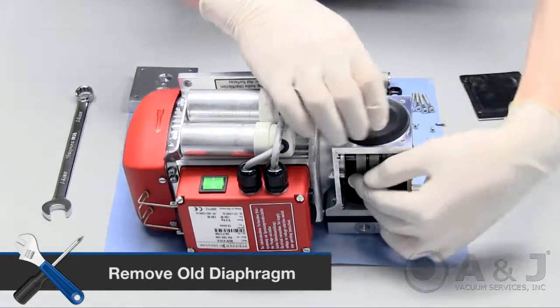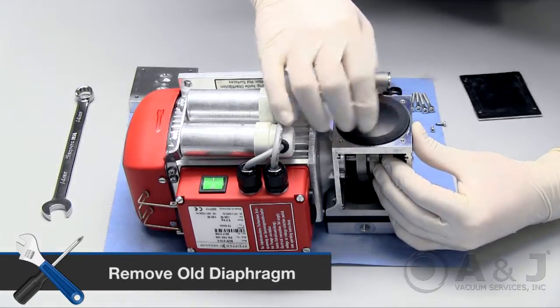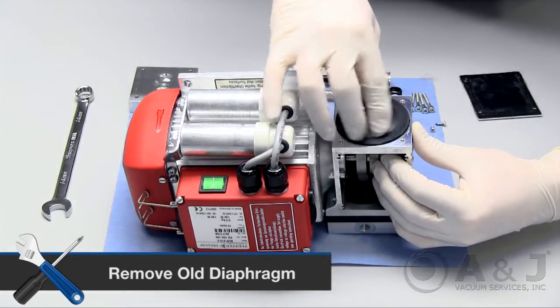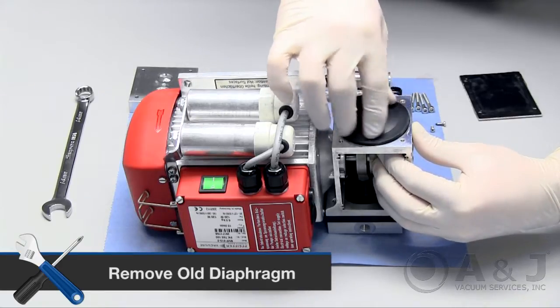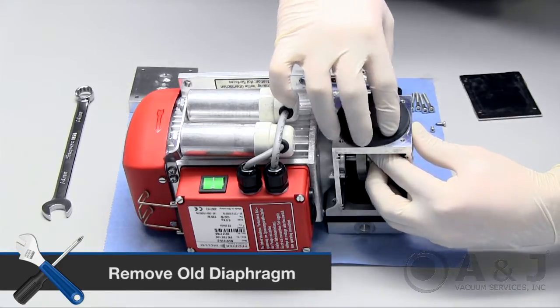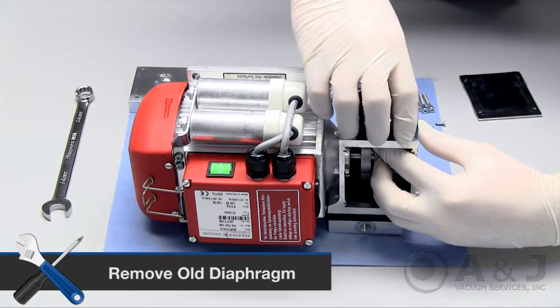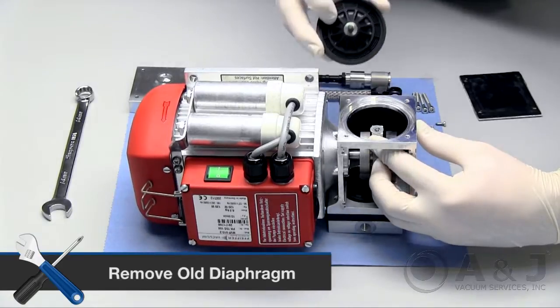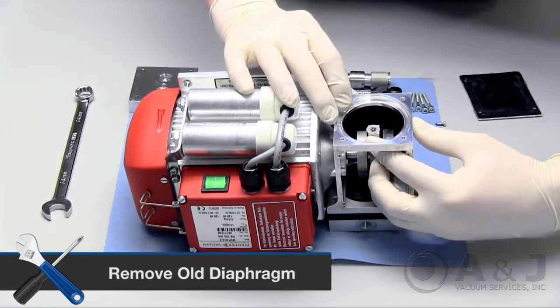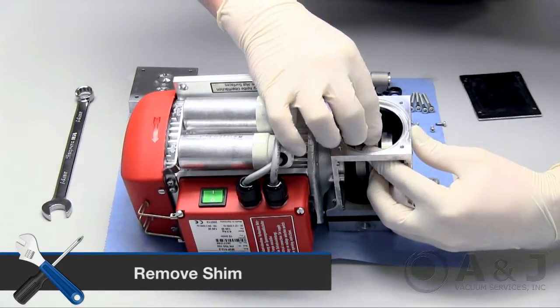Use your fingers to gently loosen the edges of the diaphragm. Simultaneously use the other hand to push up the shaft while turning the diaphragm in a counterclockwise motion to remove it. This is to prevent the shim on the bottom of the diaphragm from falling down and getting lost. Take the shim out from the compartment and place off to the side.